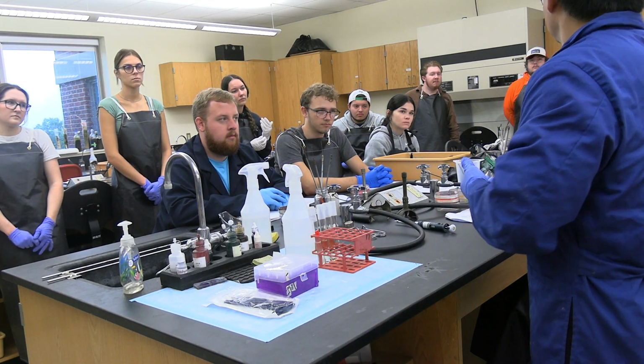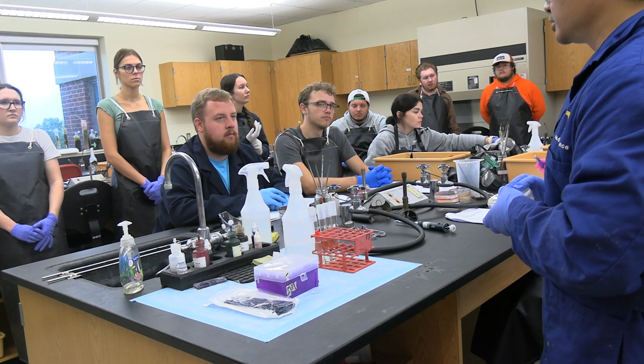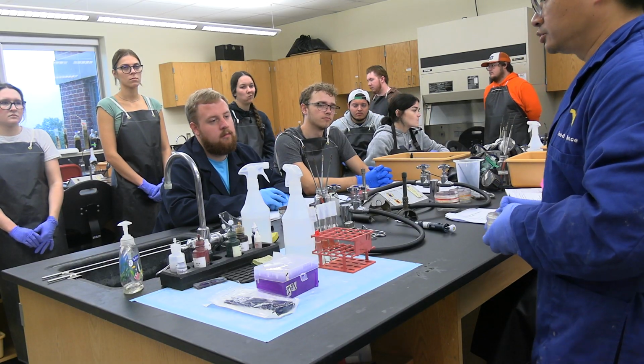This, put on the tray. We take it out next week, Tuesday, and you should have very good colonies in some of the dilution factors. So this is what we're going to do today.